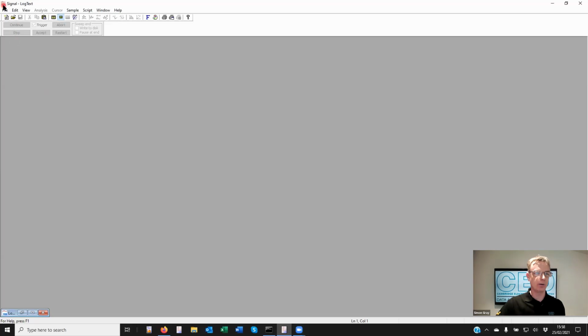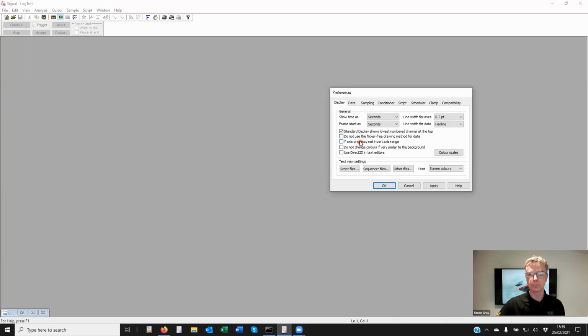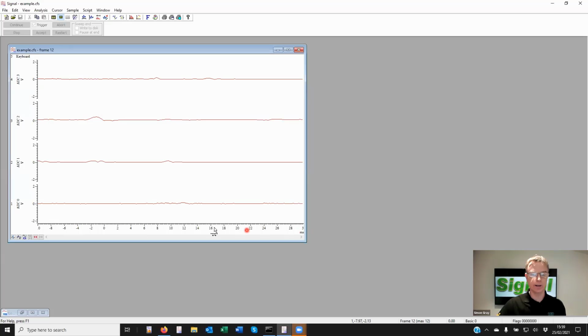Perhaps one of the things I want to start by saying is that if you're using Signal by default, the time units will all be set to seconds. And most of you, I suspect, will be using milliseconds. So if you go into the preferences, we can say show time as milliseconds, which is probably the most convenient for you. Having done that, if I now open a file, you can see the x-axis is now in milliseconds, which is much more convenient to work with.